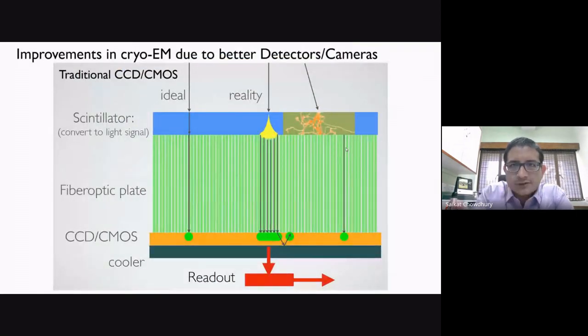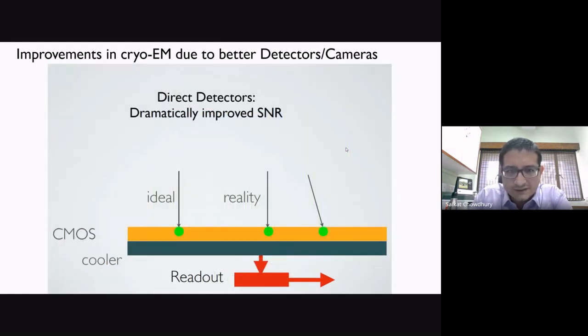So essentially, nowadays we have better cameras. I won't get into much of the details. In the past, we used to image in CMOS or CCD cameras. Nowadays, we have direct electron detectors where every single electron hitting the camera can be identified. So we have less loss of resolution or spread of the resolution. And we get back a lot of the information that is coming from the electron waves that are hitting the camera. And I won't get into those details. So this has also revolutionized EM today.